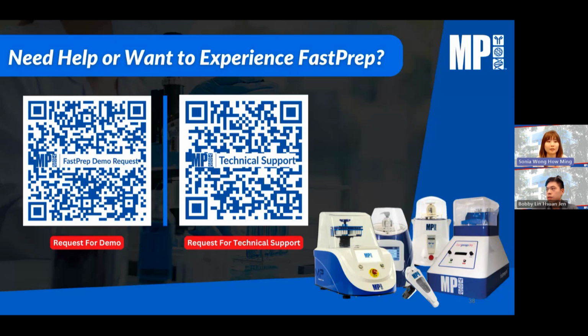If the starting amount is not enough, then you will probably get a low RNA yield, which is also directly related with RNA integrity, because most of the time, if you don't extract RNA with a high enough yield, it will affect its integrity.